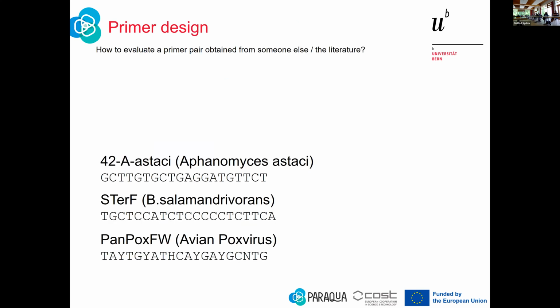Primer design. Okay, for this, I brought a small exercise, and I ask you to pass these on. Don't look at them yet, but just pass them on. And then we can have a look at what we take care of when we look at primers.